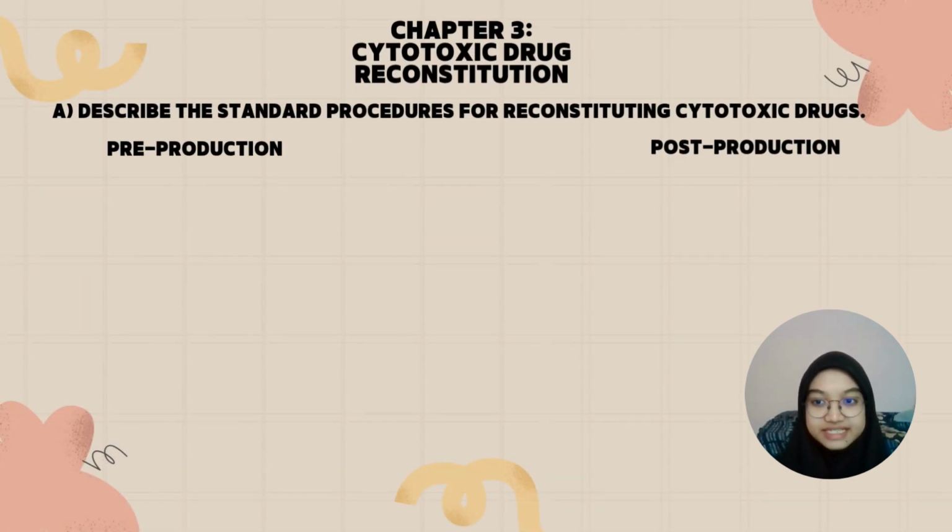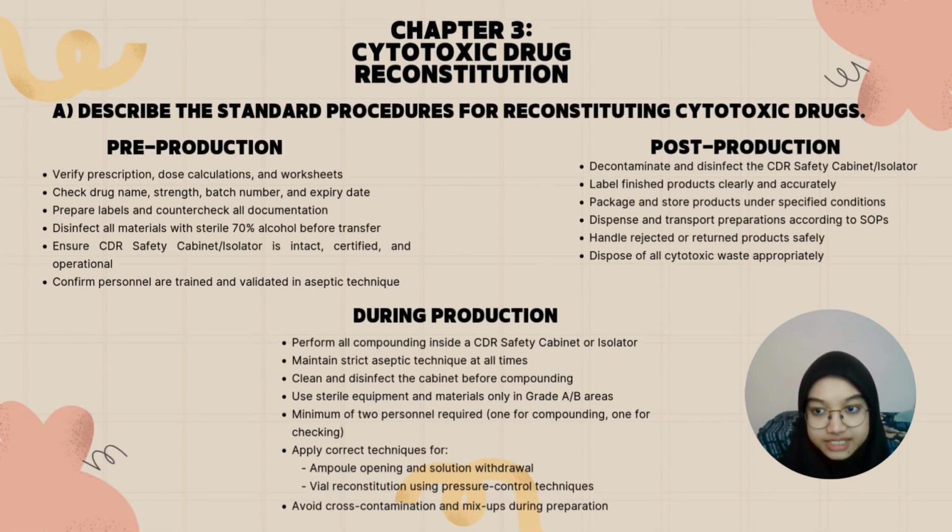The next chapter is cytotoxic drug reconstitution. The first question is: describe the standard procedures for reconstituting cytotoxic drugs. We have three parts. The first part is pre-production.